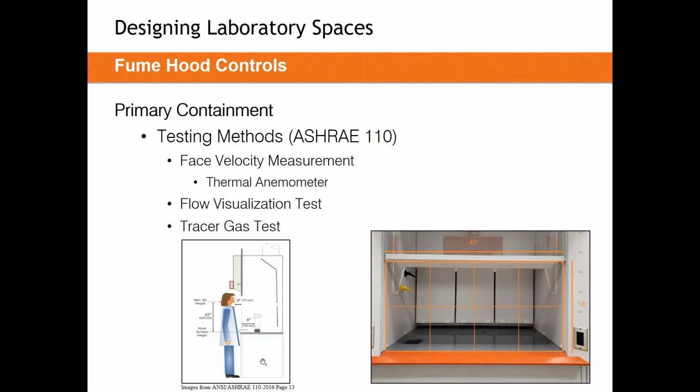The second way is to release smoke from the outside of the fume hood, generally in the closed sash position, but also in the open sash position, to make sure, again, we don't have lazy flow and that air moves right into the fume hood. Again, that could happen at 82 feet per minute, that could happen at 101, that could happen at 119 feet per minute. But if smoke generally goes into the fume hood nice and quickly and directly, that fume hood's working pretty well.